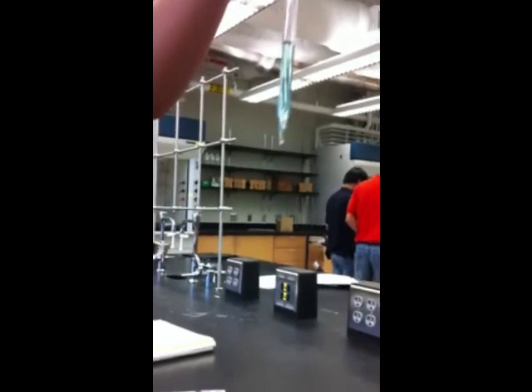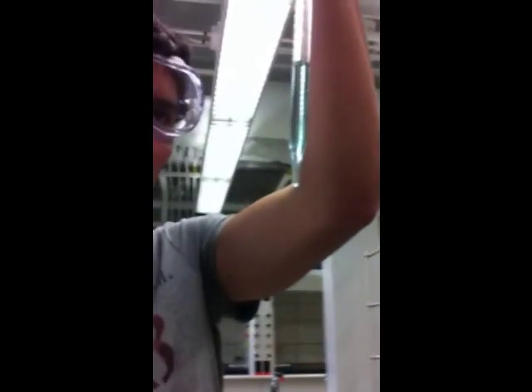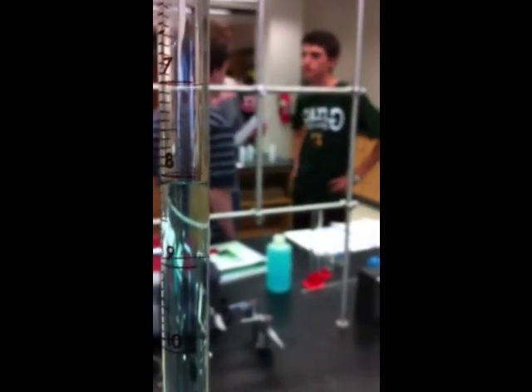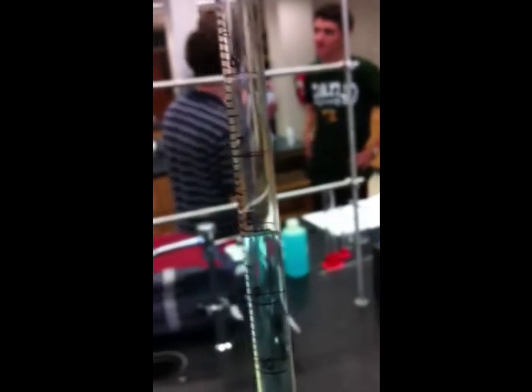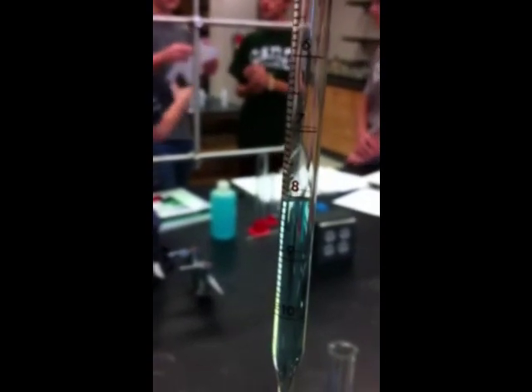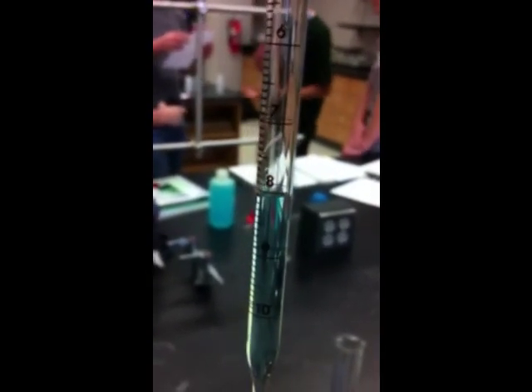Now we are going to take a reading of it. How we do that is we look at the bottom of the meniscus here at the pipette. You can see the bottom of the meniscus right here. That is caused by surface tension and adhesion from the water. Since water is polar, it's going to start to climb up the walls of the pipette, and surface tension is going to cause it to have that concave swoop at the bottom. And we take the reading from the bottom of that swoop.